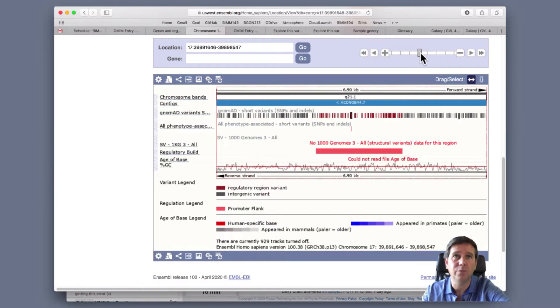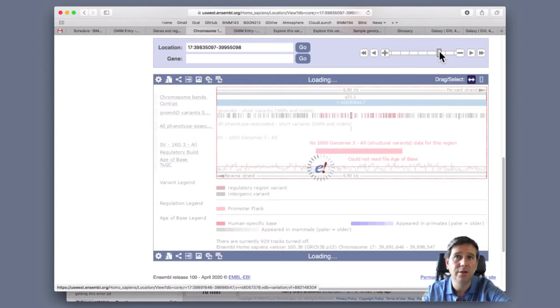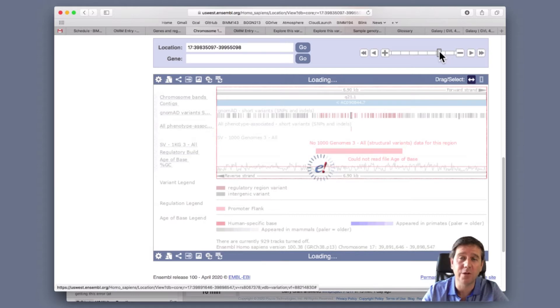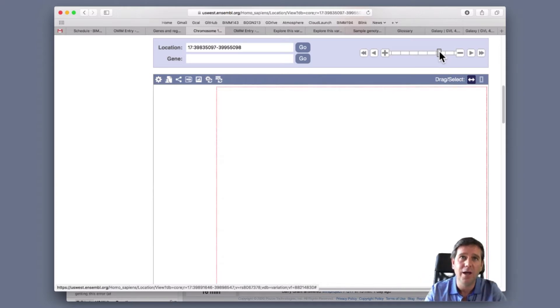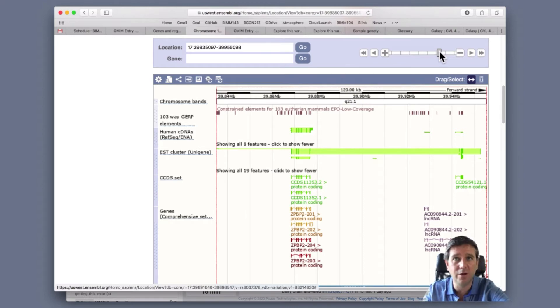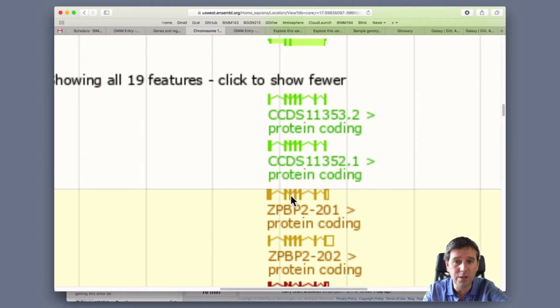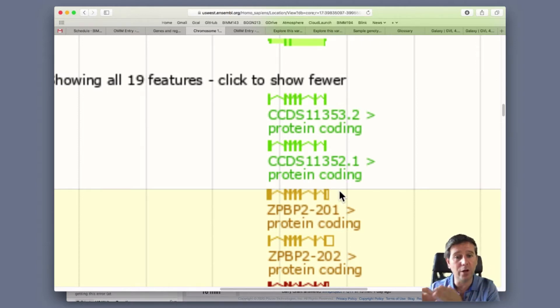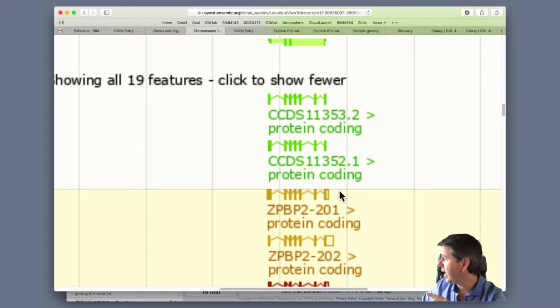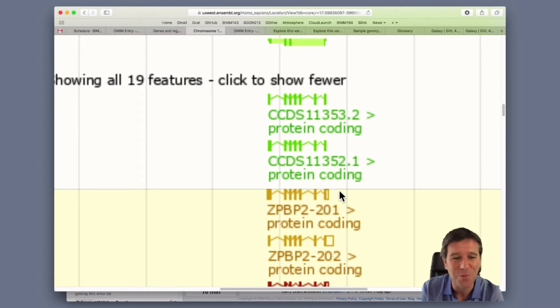We could zoom out and move along - you can go along the strands and navigate to see where those genes are. Zooming back out, we start to see the genes again, where the gene boundaries are, where the transcripts are, where the exons and introns are. Now we're starting to see ZPB2 - there's the exons, the coding sequence, the protein coding region ZPBP2. There's the introns. You could start to explore what's upstream or downstream of a particular coordinate - where these SNPs lie in this region of the genome. That's a lot of information - this is Ensembl.